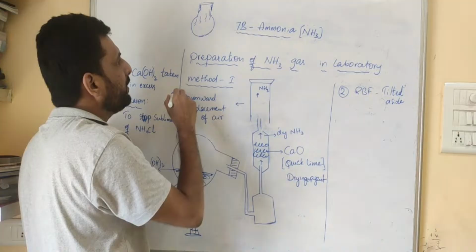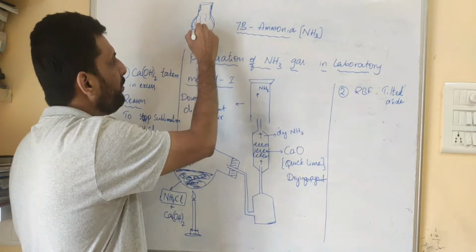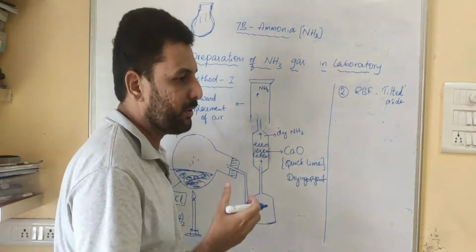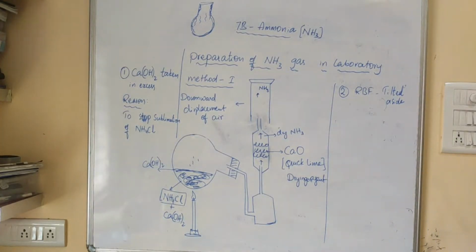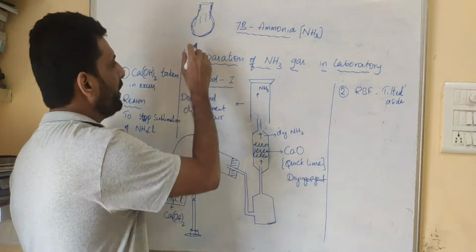Because of the condensation, the water droplets will form and it will form streams. The water stream will come down, and if the water stream touches the hot part of the round bottom flask, which is made up of glass, it will break. When you put water on hot objects, mainly glass apparatus, because of the sudden contraction, the glass apparatus will break. Yes or no? Understood?